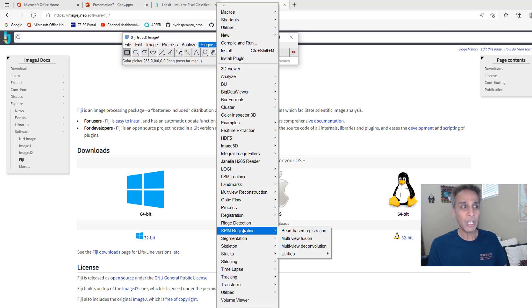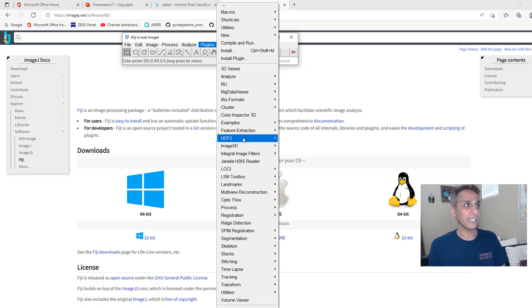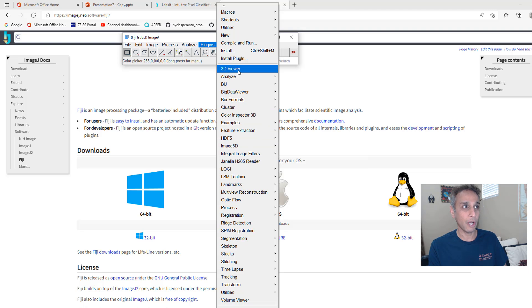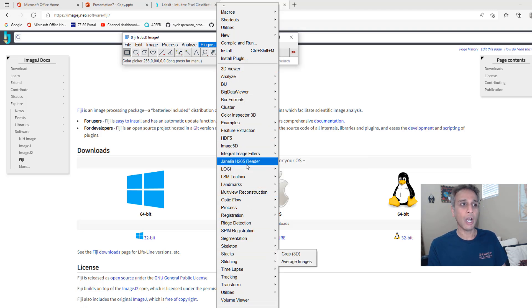But if you download it from Fiji then it comes with a whole bunch of plugins and explore them, very, very useful. So our goal is to get this LabKit as part of our plugins right here.